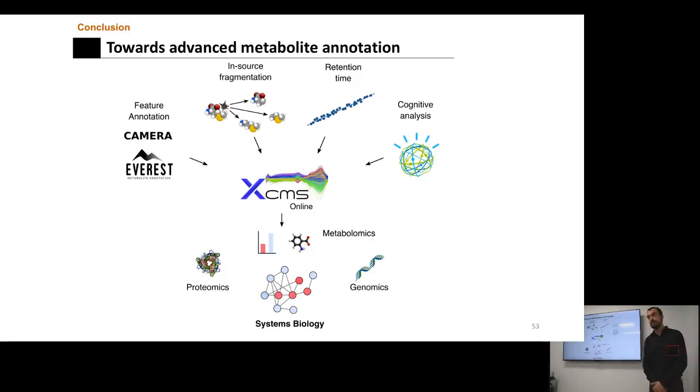And Paul just typed an answer into the chat, but if you're not reading the chat, the final question is, great talk to you both, enjoying it so far. Do you think that in the near future, METLIN could include fragments from lipid compounds?